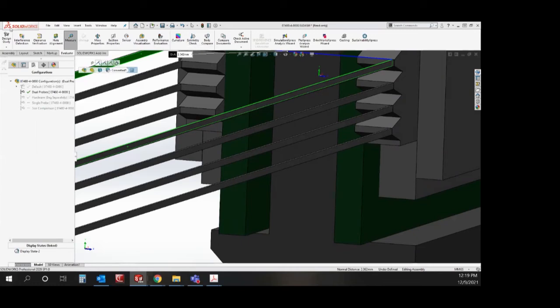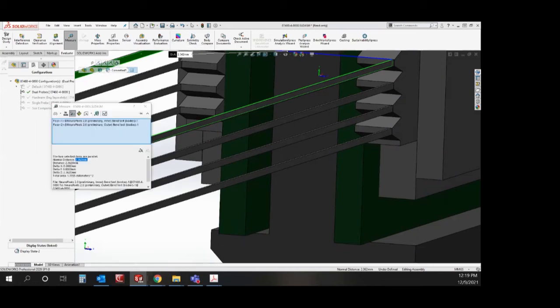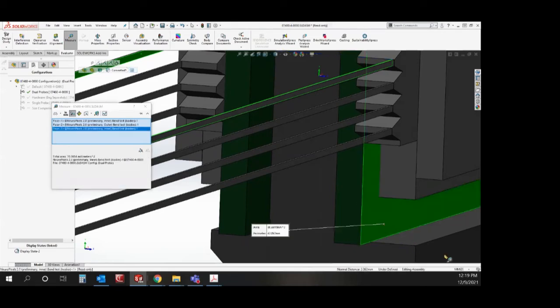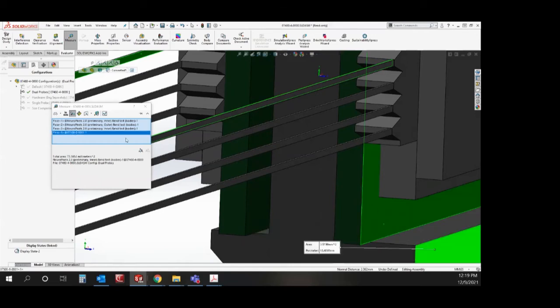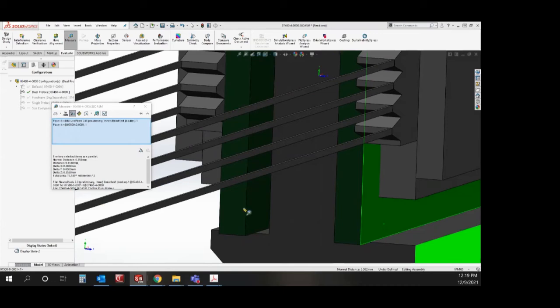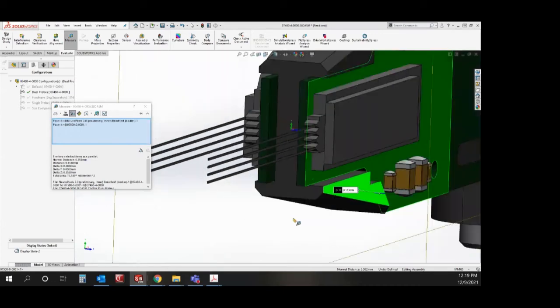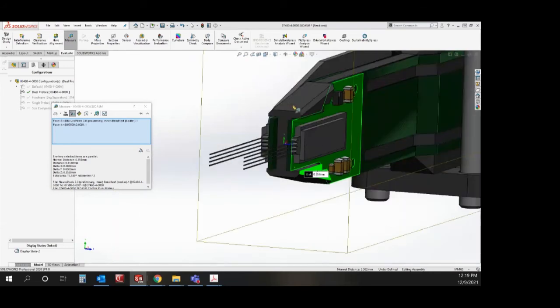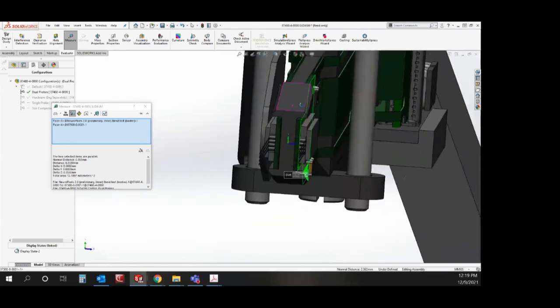Approximately 2.4 millimeters. And the furthest we can get if you have the edge of your probe PCB towards here, you can gain an extra .8 millimeters between probes shanks. We have some people that may want to separate the probes further. If so, we are available to do custom design work to increase that distance.